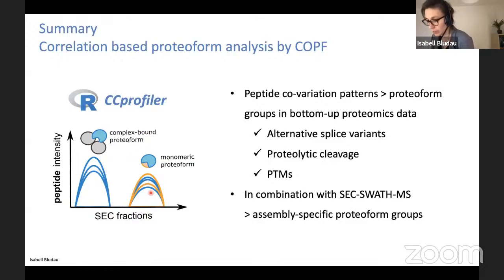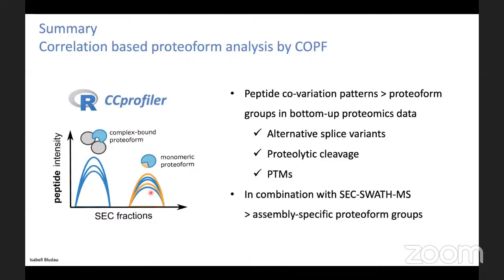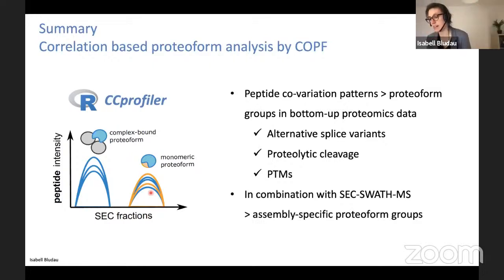Then a question by Raja: do you identify occupancies without an enrichment step for phosphopeptide occupancy? Yes, I think I could show you that we could see phosphopeptides also without the enrichment step in our data. We actually also performed a systematic phosphosite analysis, but this was not so spectacular.